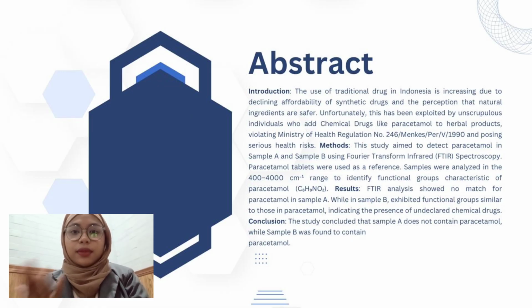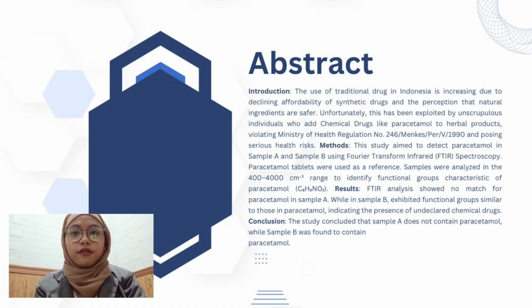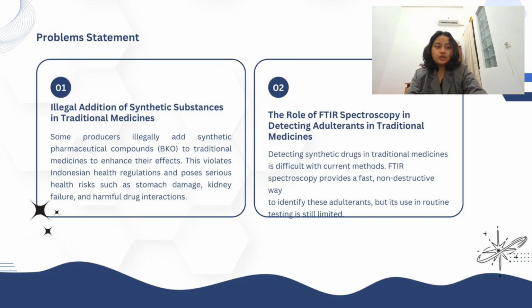In conclusion, sample A is safe. Sample B, however, contains undeclared paracetamol, posing risk for consumption, especially if they're also taking other medication with paracetamol. FTIR spectroscopy proved to be a fast and cost-effective detection method. Thank you.